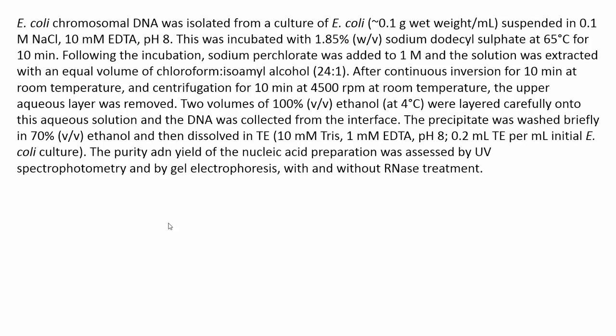Okay, so let's go through how to convert a legend back to a protocol. This is the legend over here, and just a reminder that this legend was produced based on working out the final concentrations of various reagents added into the various mixtures as we went through this isolation protocol. So for example, we have a final concentration here of 1.85% SDS, and we have a final concentration here of 1 molar sodium perchlorate.